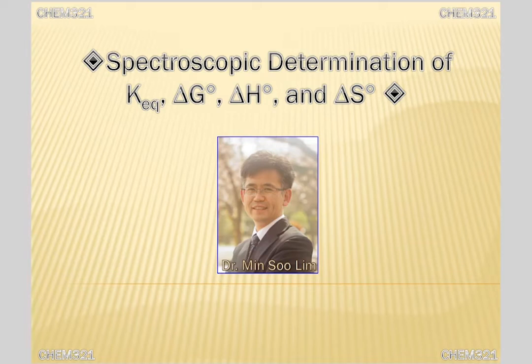I am Dr. Min Soo Lim, and I will show you how to carry out the lab in the experimental and theoretical aspects. You will do a 2-week-long experiment titled Spectroscopic Determination of KEQ, delta G naught, delta H naught, and delta S naught. I want you to follow my instruction thoroughly, slide by slide.